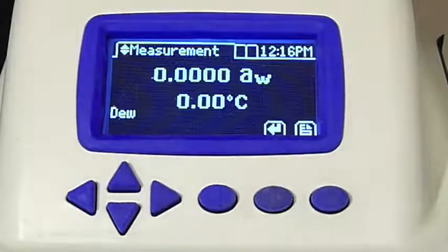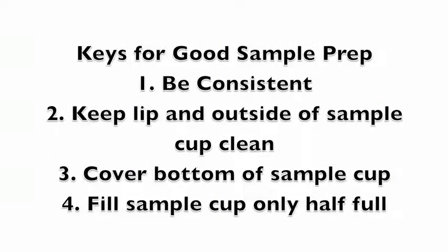While the Series 4 warms up, let's prepare a sample by reviewing four keys to good sample preparation. First, be consistent — doing the same thing every time will ensure more repeatable results. Second, keep the lip and outside of the sample cup clean; you can save yourself a lot of time by avoiding contamination in the first place. Third, covering the bottom of the sample cup completely will ensure an accurate sample temperature. And fourth, filling a sample cup only half full helps you avoid other instrument cleanliness problems.